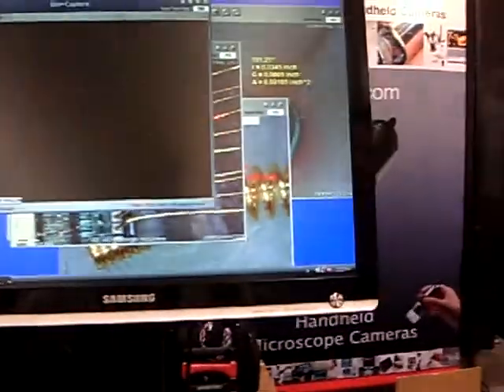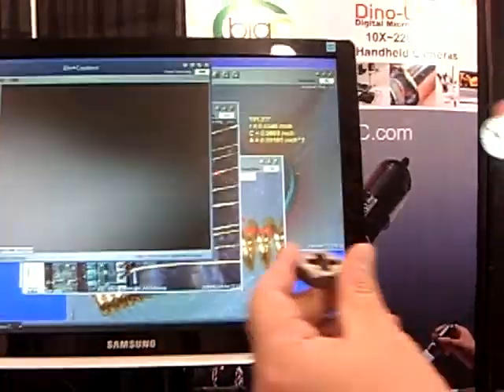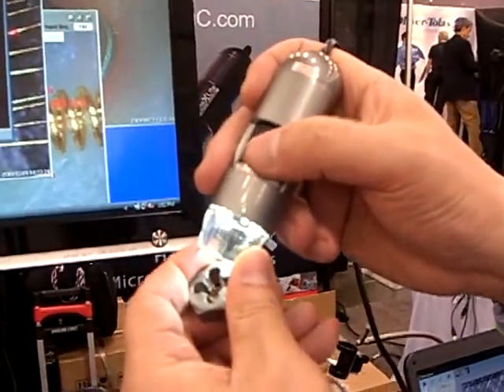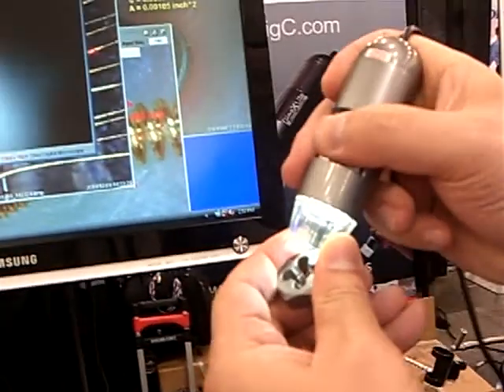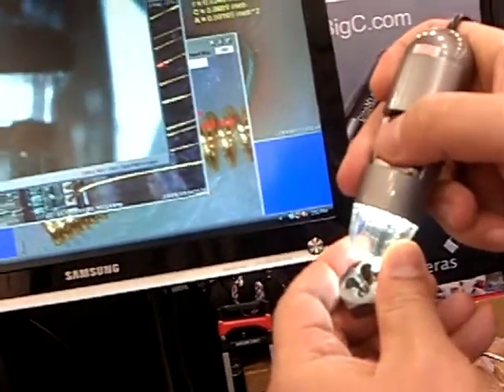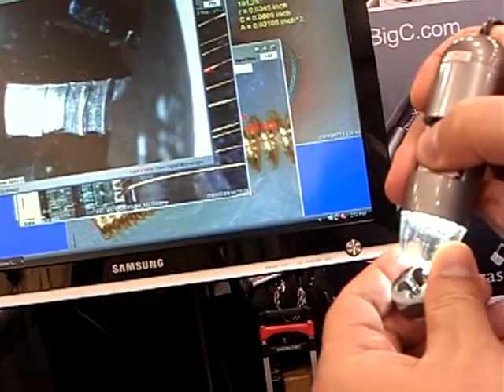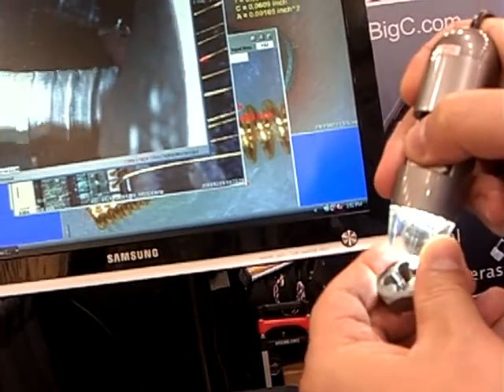You can adjust the angle. Point it, then switch it back to a different angle. You can see the object from the back or the front, just by rotating the lens.